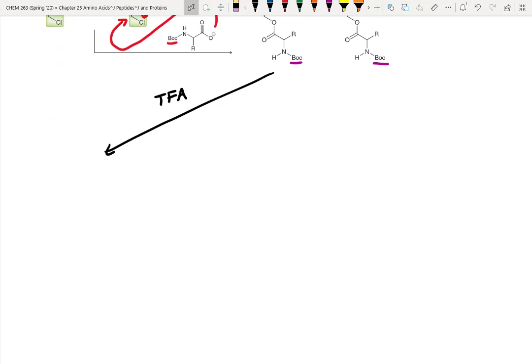So now what we have is this amino acid dangling off of our polystyrene resin. Let me clean this up a little bit. And now we've got a free amine on there as well. Typically though, because we're treating this with TFA, this amine coming off the end is actually going to be protonated, right? But not a problem. In fact, it'll work in the next step anyways.